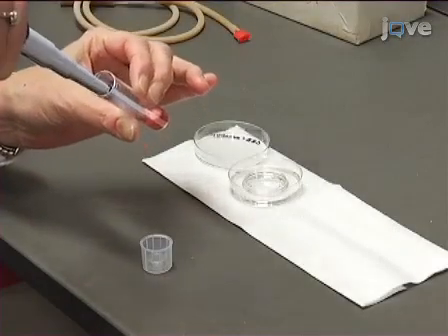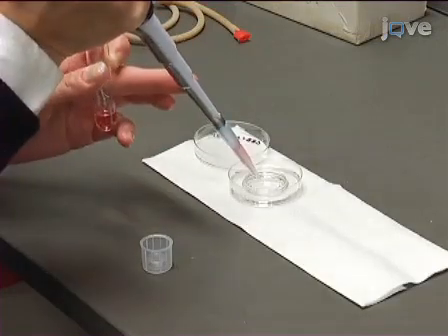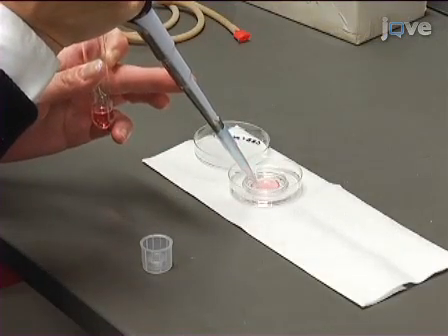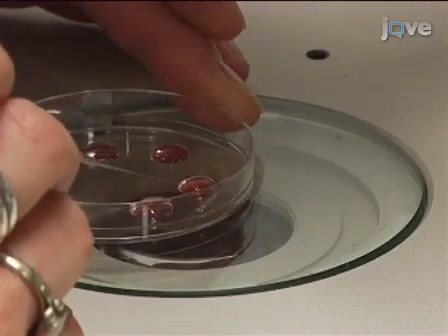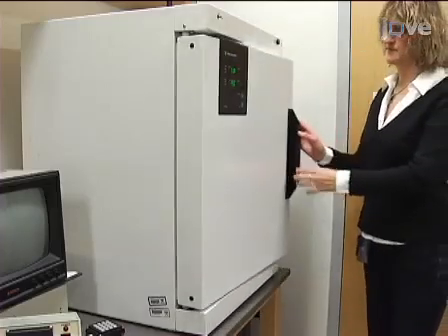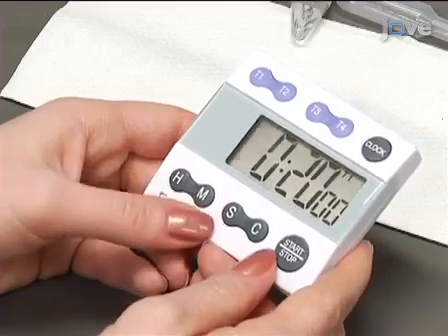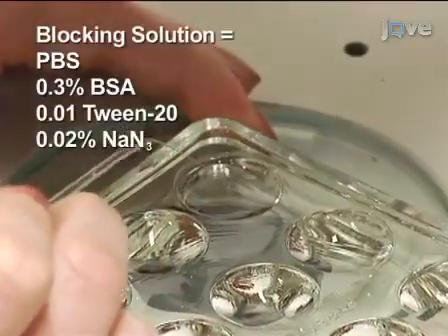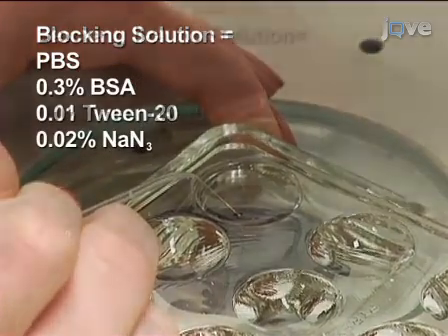Place 750 microliters of CZB containing 100 micromolar monastrol into the well of an organ culture dish that has water in the outer ring. Now wash the eggs through several drops of CZB plus monastrol and then transfer them into the organ culture dish and incubate for an hour. Fix the eggs in a watch glass containing 2% paraformaldehyde and PBS for 20 minutes at room temperature. Next, transfer eggs into blocking solution and store at 4 degrees Celsius until processing.